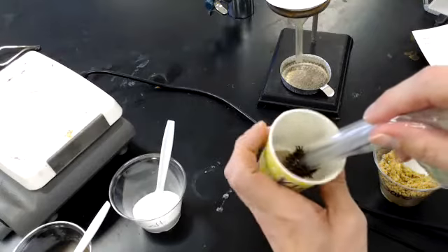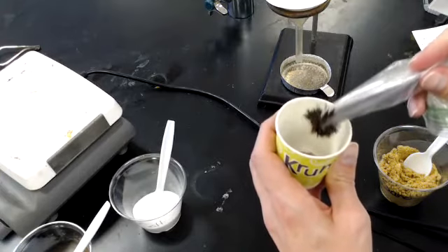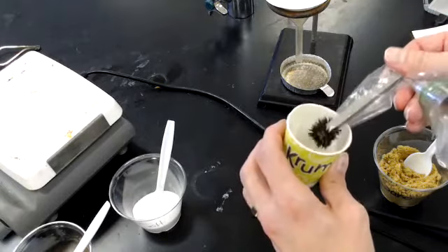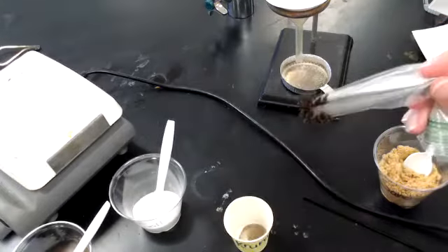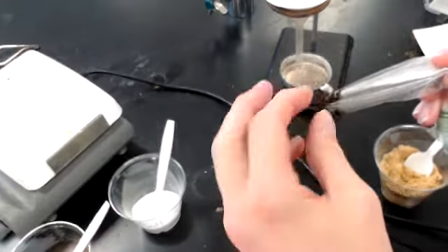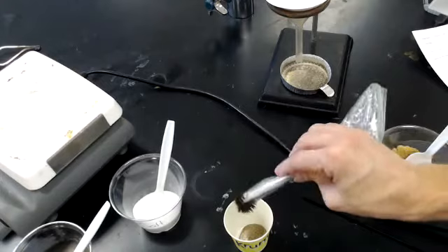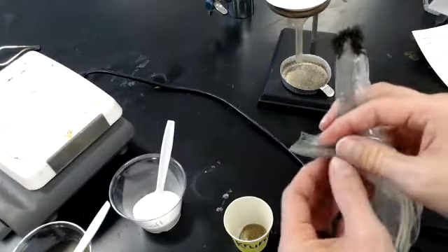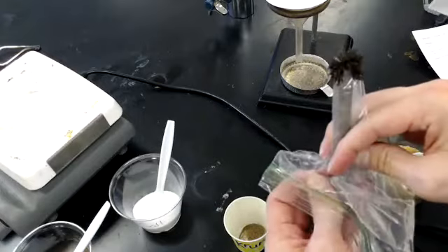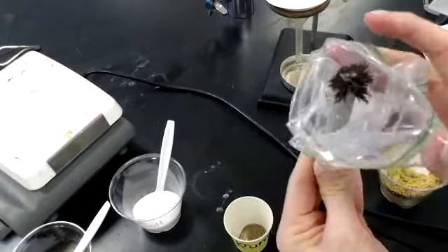I'm going to tap back into my mixture again, to be sure I got all the iron. I think I got all the iron. I'm going to gently tap away the sand that also got stuck. Okay, that looks really good to me. Now what I want is to know how much mass this iron is. And that means I have to get all these little tiny pieces off. Well, I have a benefit of having the plastic bag here. Check out this magic: if I wrap the plastic bag inside out around the iron.